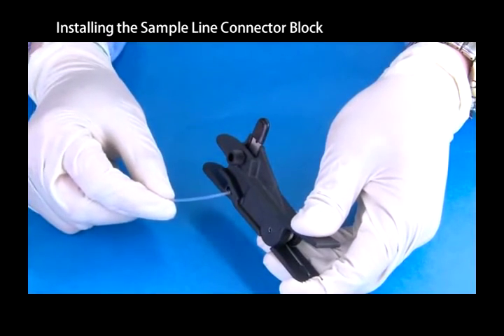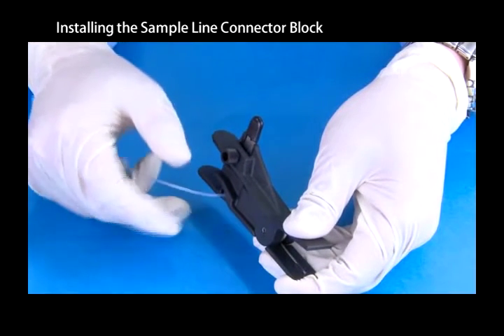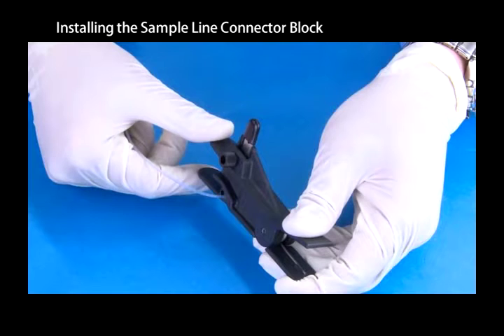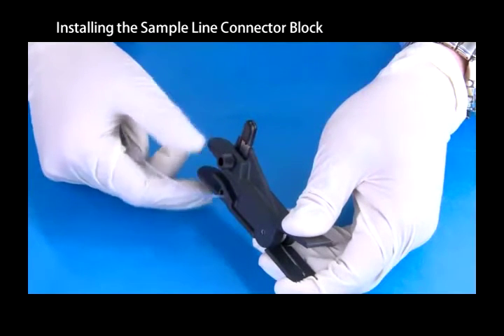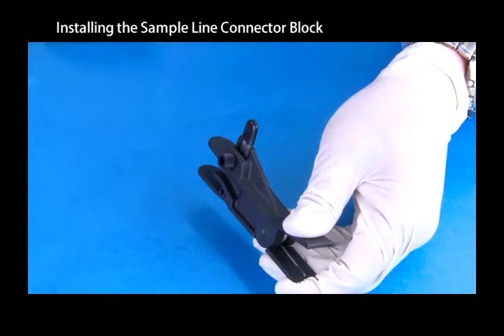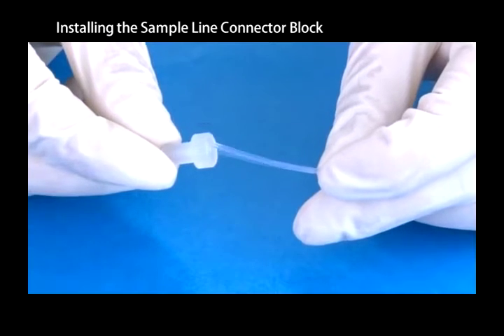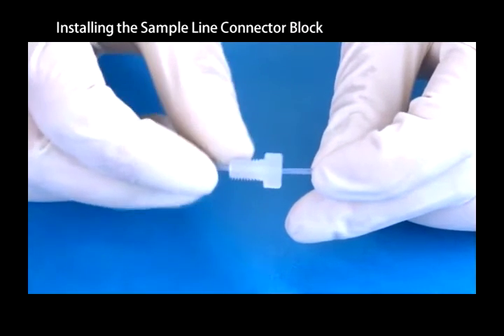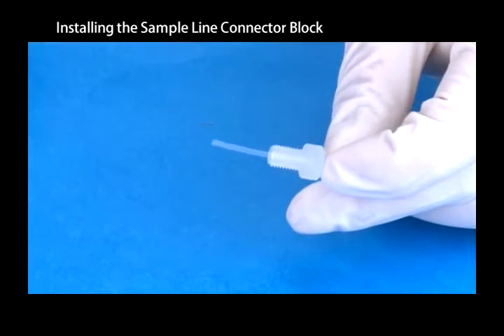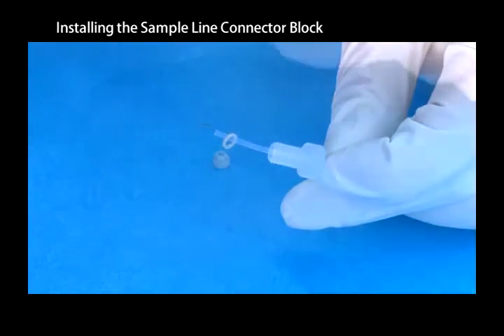Cut the ends of the PTFE tubing at a 90 degree angle to avoid leaking or clogging. Slide the PTFE nut, back ferrule, and front ferrule onto the tubing. The tubing should protrude between 0.5 and 1 mm beyond the front ferrule.